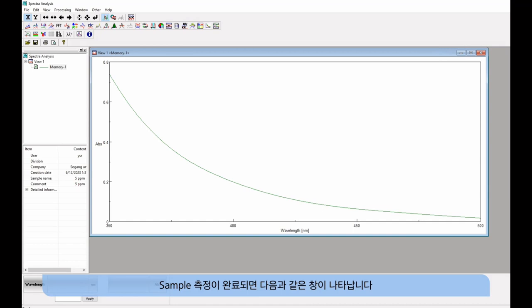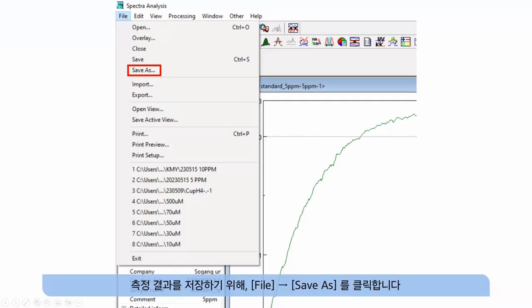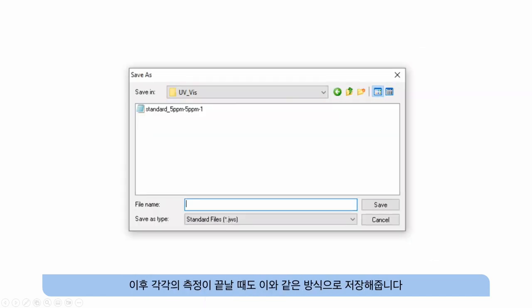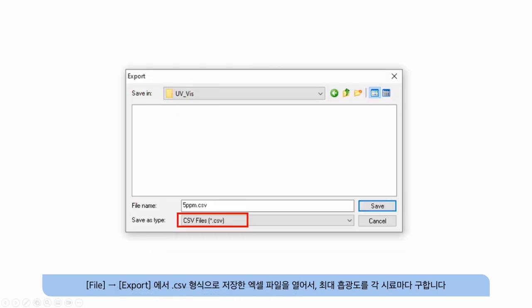When sample measurement is completed, the results window appears. To save the measured result, click save as in the file menu and save the file in JWS format. After each measurement is completed, save them in the same manner. Open the Excel file saved in CSV format from file export and find the maximum absorbance for each sample.